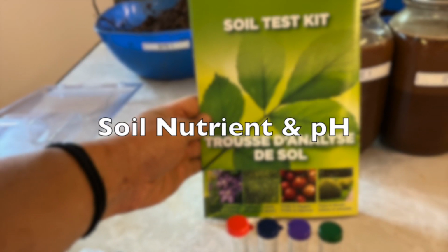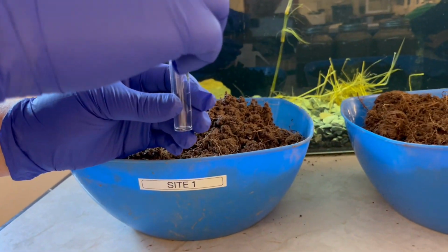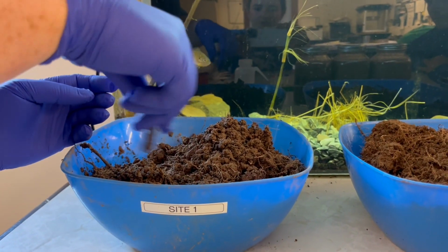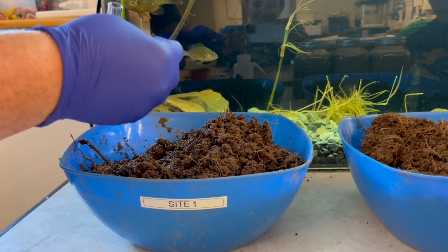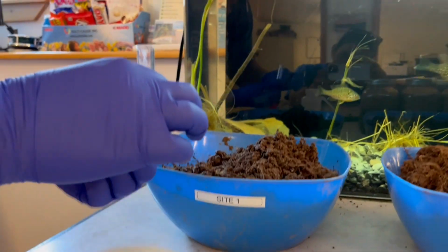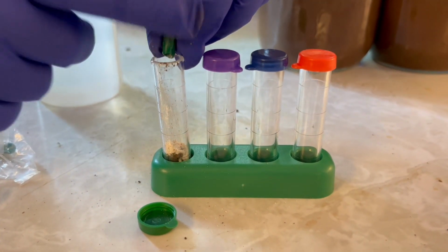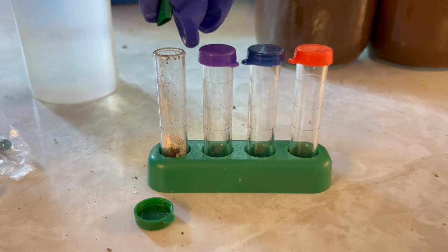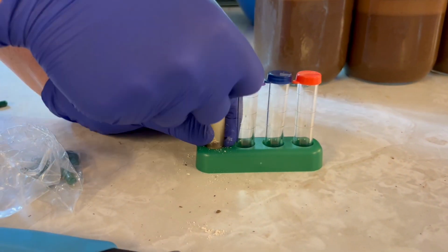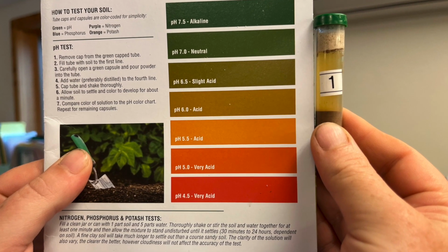The last test we're going to do is soil nutrients and pH. We will be testing for nitrogen, phosphorus, and potash, and we will be using a very simple kit. Let's start with pH. Using the green tube, fill with small soil particles until the first line. Add in a green pH capsule and then fill with distilled water to the top line. Shake for a minute and then let sit for another minute to develop. Compare to the pH key to determine your pH.